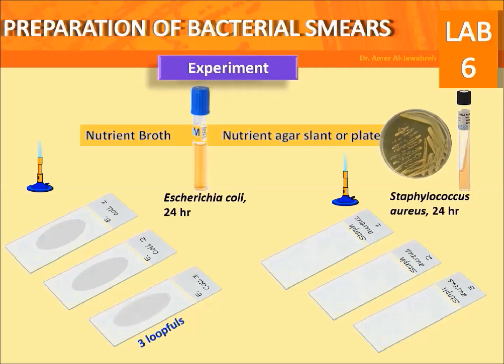Prepare smears as described earlier in this video. Allow to air dry, then heat fix.